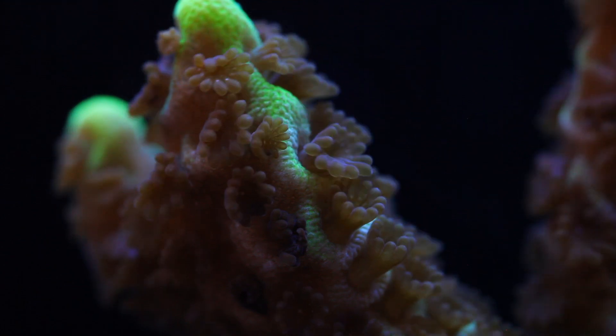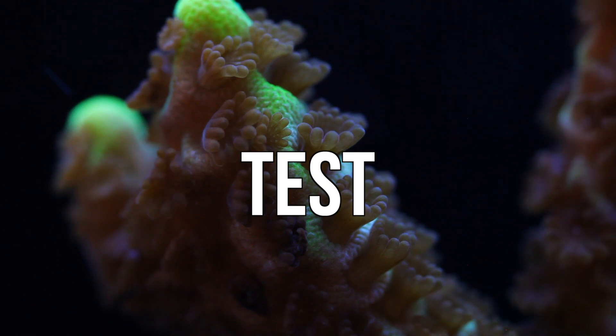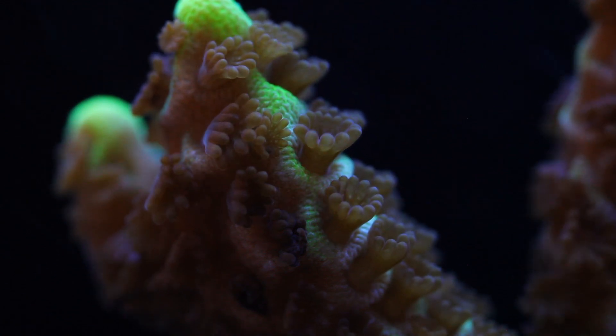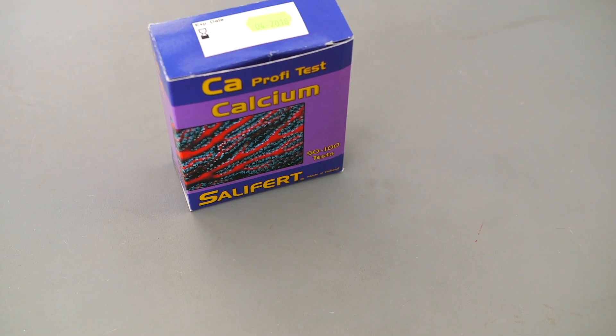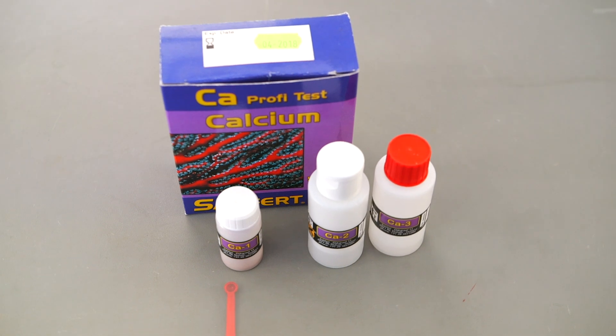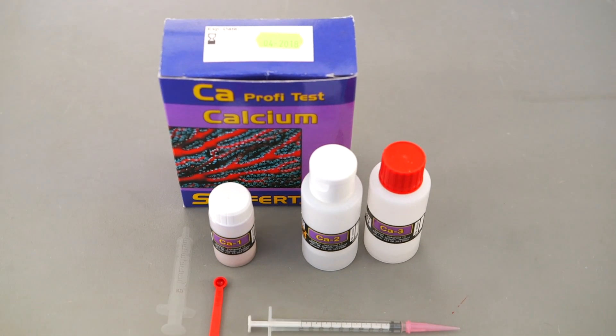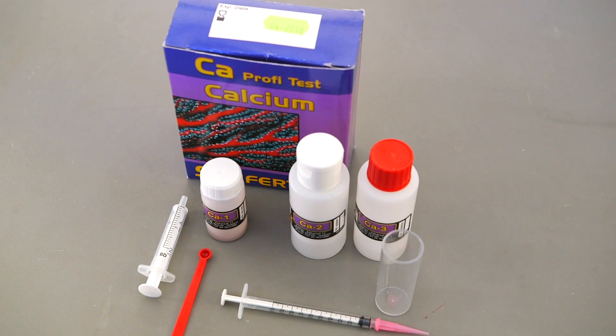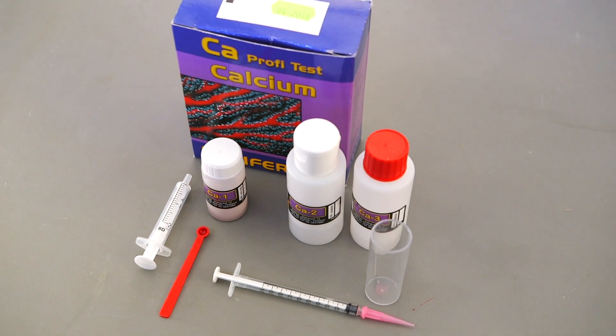The only way to know if you need to supplement calcium is to test for it regularly, because different aquariums will have different calcium needs. Luckily testing is pretty easy to do. I'll demonstrate with a Salifert test kit. There are many brands out there and I chose Salifert mainly because it's probably the most popular brand and it's one that I have the most familiarity with.